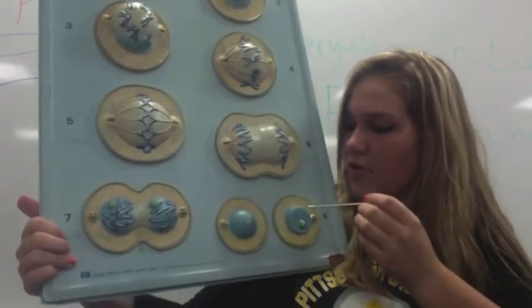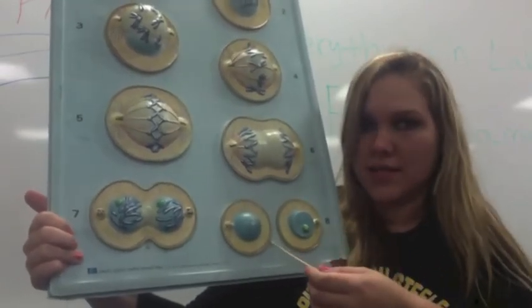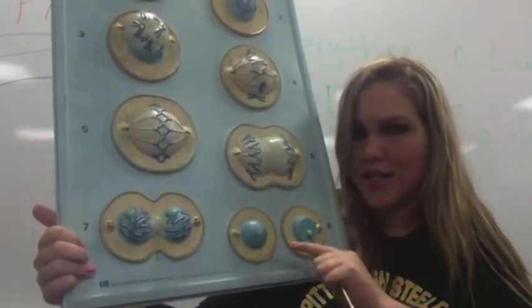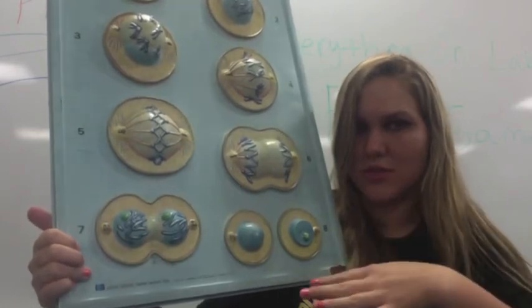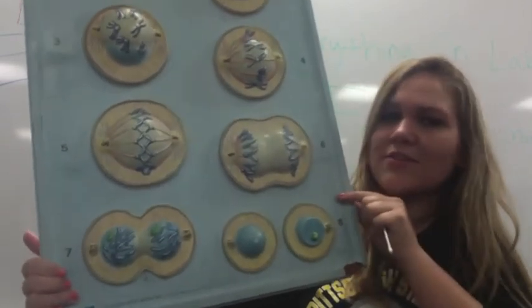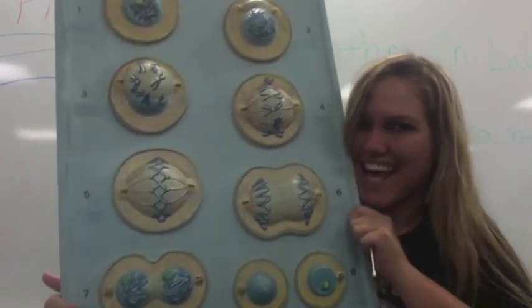And then this over here is cytokinesis, and that's when the cells actually split into two different cells. And so those are your phases of mitosis.